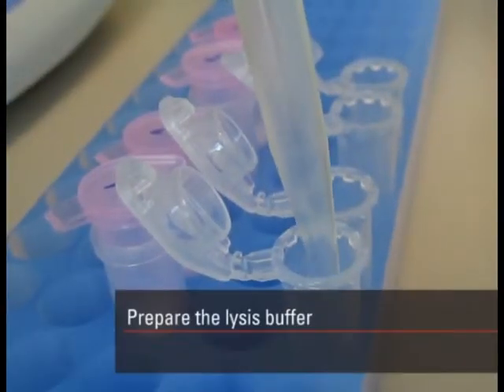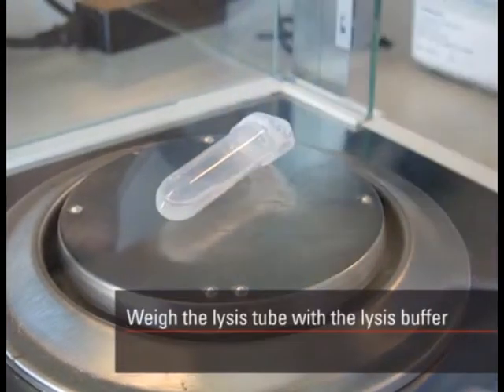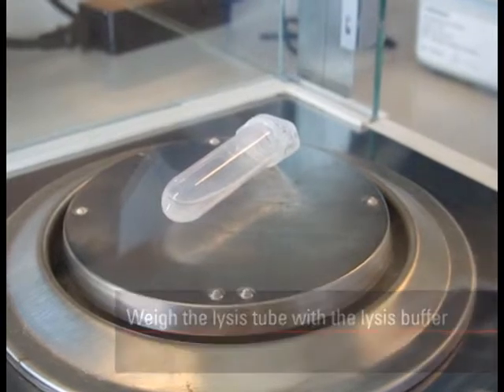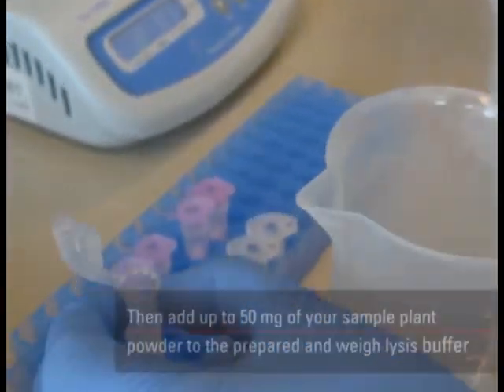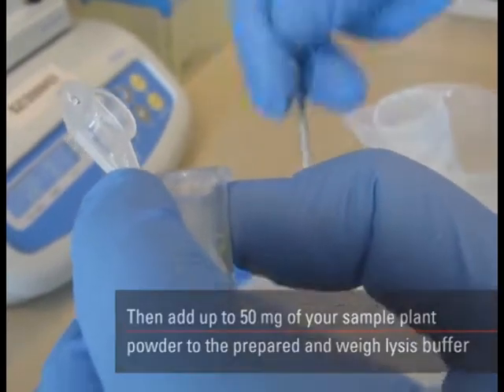Prepare the lysis buffer. Weigh the lysis tube with the lysis buffer. Then add up to 50 mg of your sample plant powder to the prepared and weighed lysis buffer.